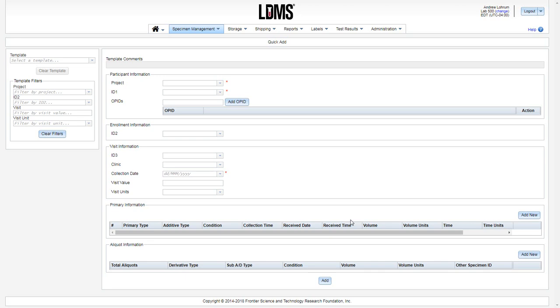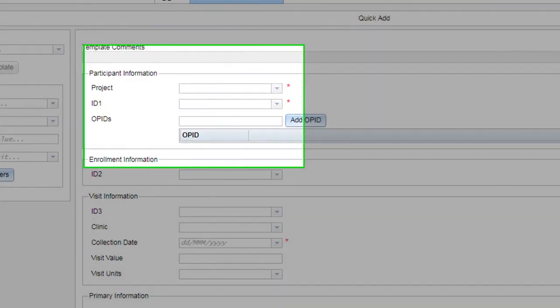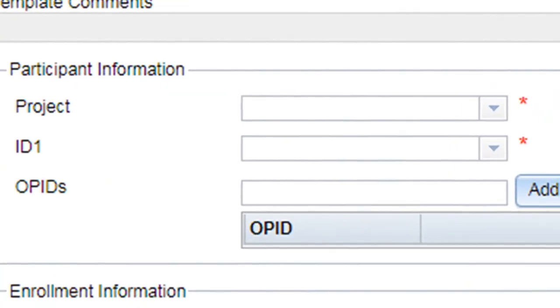In order to create a new specimen entry in WebLDMS, you will simply fill out the applicable fields in the QuickAdd form. We start at the top of the form under Participant Information.